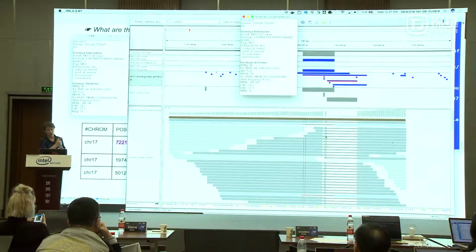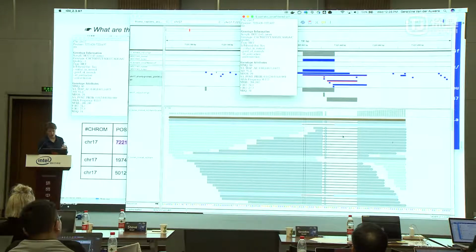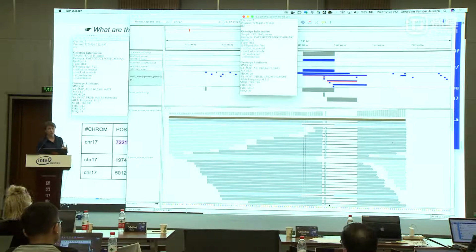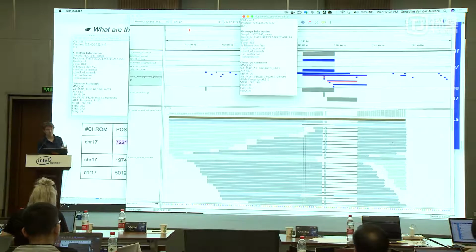It's also falling below the allele frequency cutoff that is based on our contamination rates. And on top of that, there are STRs in this area, short tandem repeats. And so this is something that could be explained by artifacts better than as an actual somatic variant. Okay?